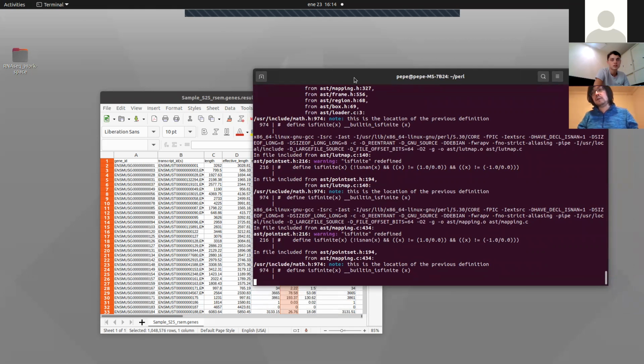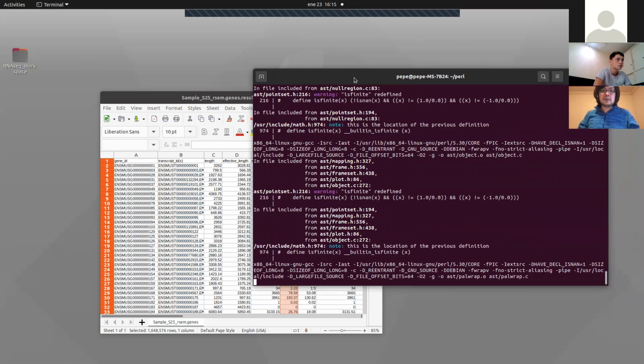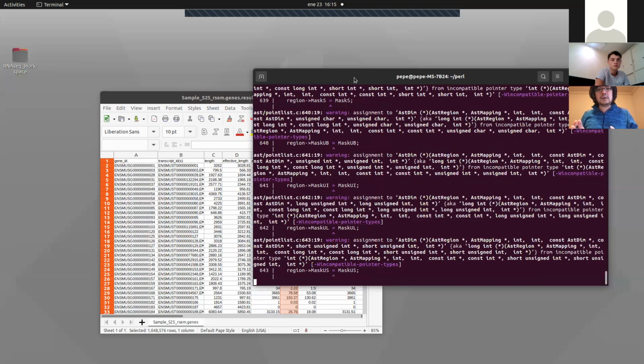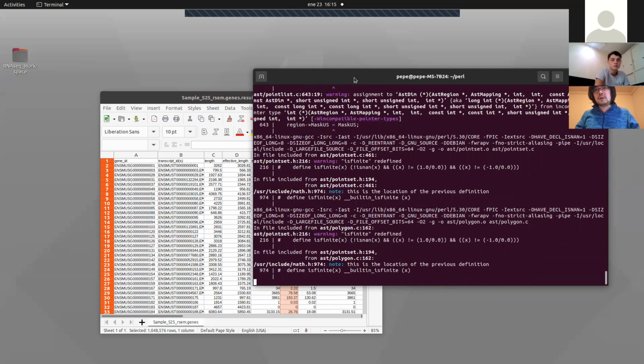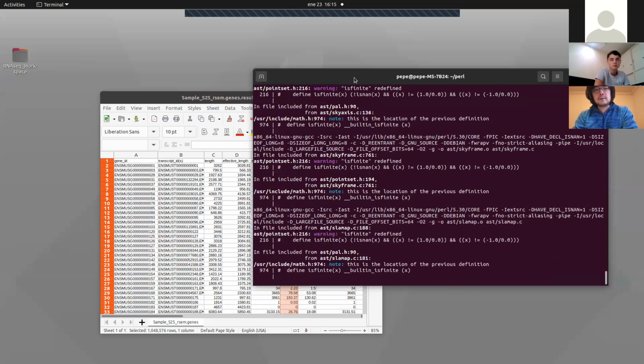The difference may be small, but DESeq may help you generate some plots, like a scatter plot, as on the website. The advantage of that kind of package is that you can generate good looking plots, and maybe it's easier, but it may be hard to run sometimes because you have to figure out all the parameters you have to specify.